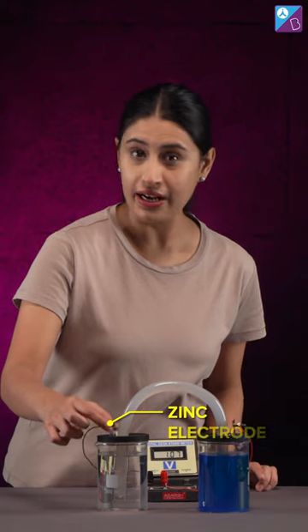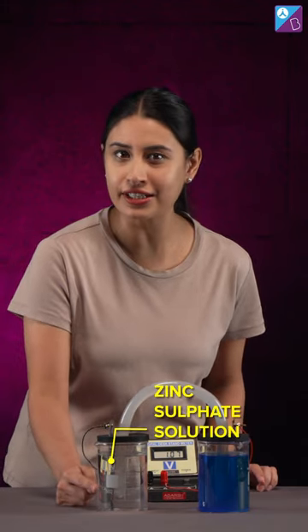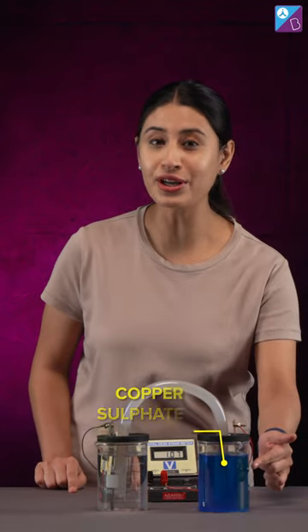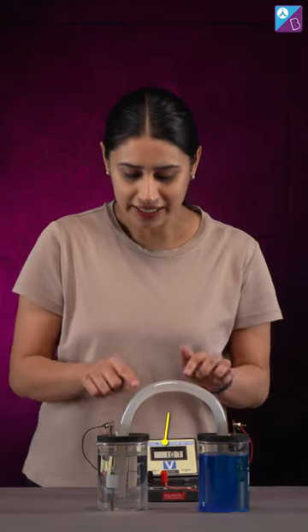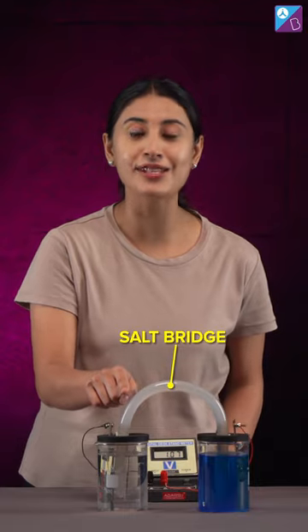Hi there. I have a setup to show you. What I have here is a zinc electrode. Here is zinc sulfate solution. Here I have a copper electrode. Here is copper sulfate solution. These are the wires connected to a voltmeter, and this out here is a salt bridge.